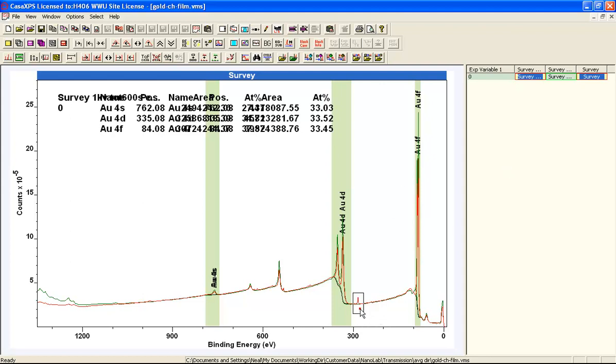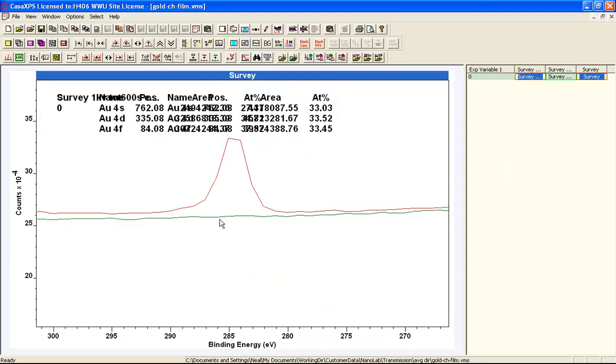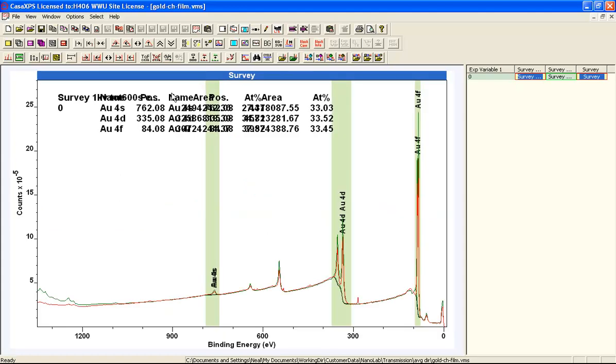So you can see this is the carbon and that's after cleaning. So it goes away. So it's at the surface.